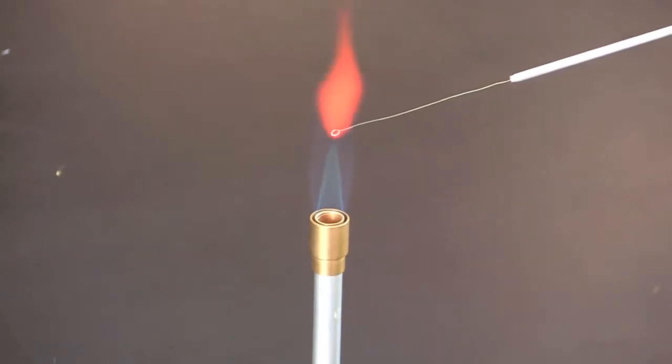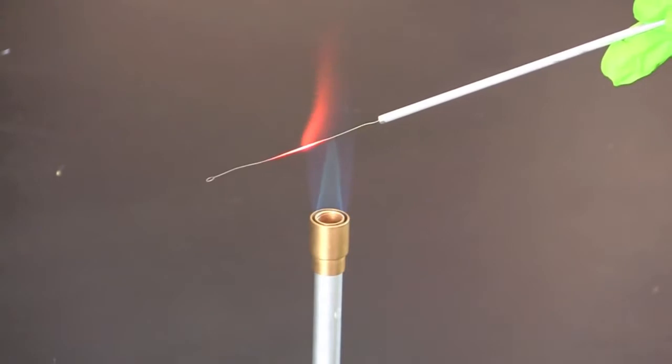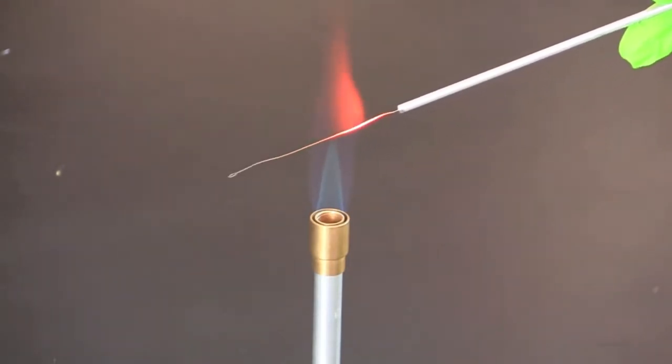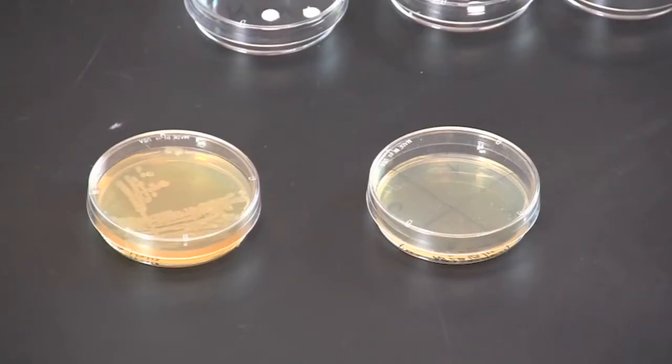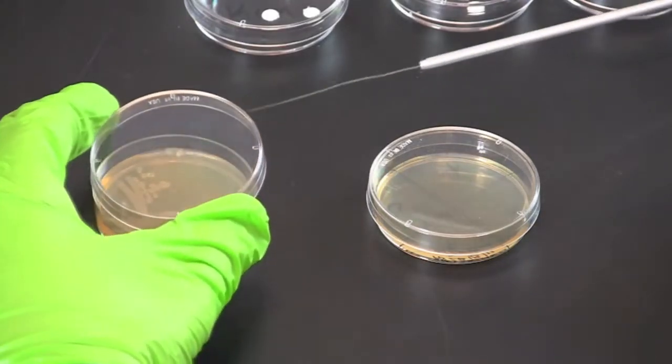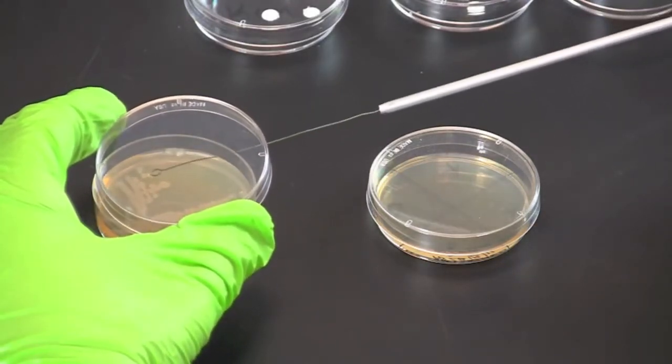Flame an inoculating loop to sterilize and let it cool. You can lightly touch the loop on an empty spot on the bacterial plate to make certain the loop is cool.